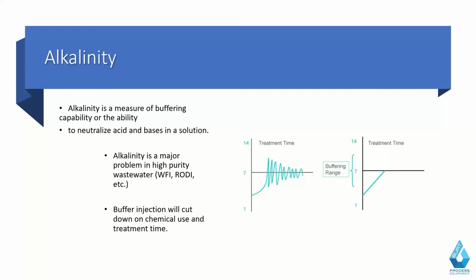So if you have a very high concentration of high purity water, and high is a relative term, I understand that, but if you're dumping, say, all USP water down the drain effectively, this is a concern. If you're using some of this in a lab and washing it down with a bunch of other stuff, it's not a concern at all. So it's a little bit subjective, but when you do have a high presence of deionized water, you do need to account for that as part of your pH treatment design.